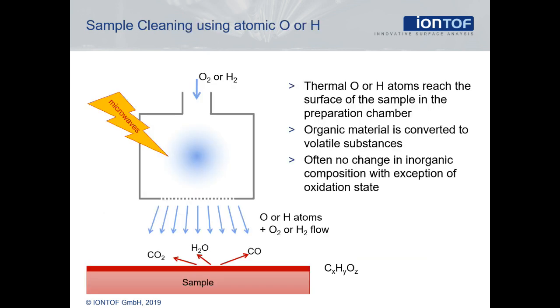The aforementioned atomic oxygen treatment is standard for many samples. In the OH source, a low-power oxygen plasma is run in a confined volume, creating oxygen radicals. These atoms flow with a stream of oxygen from the plasma chamber to the surface of the sample, while the charged particles are held back by an array of apertures. This prevents any energetic particles from the plasma reaching the surface. Therefore, only thermal energy oxygen atoms reach the surface and no sputtering occurs. The plasma is fully separated from the sample.